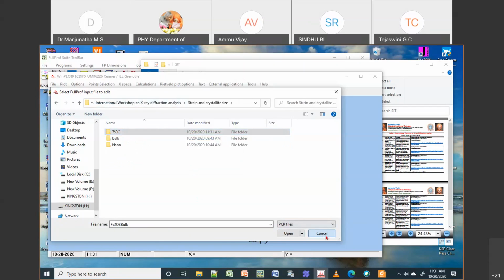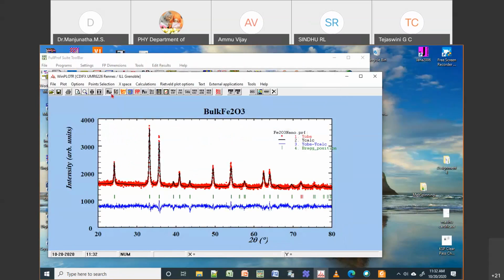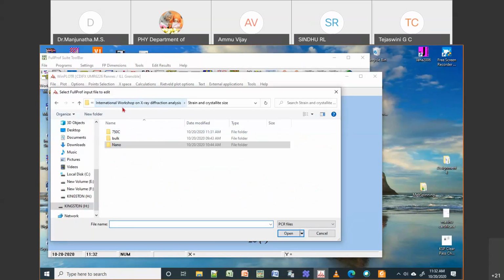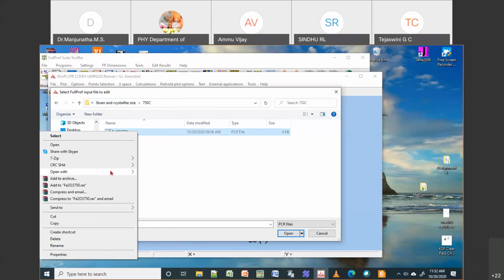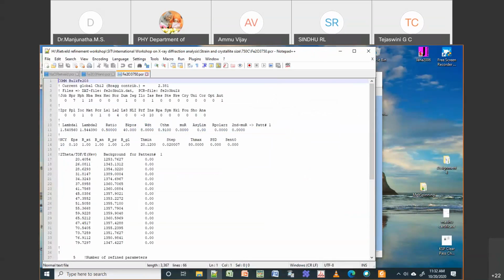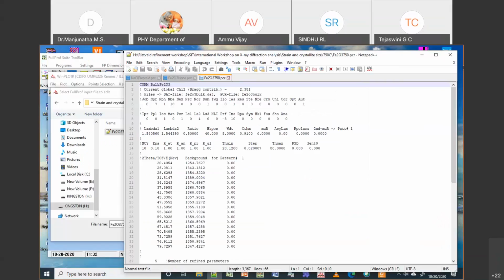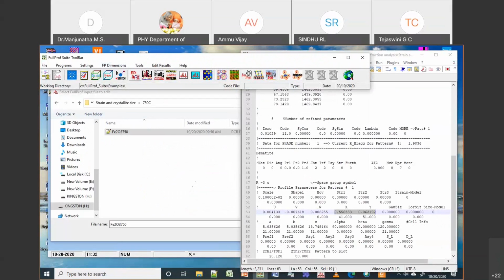So now I can just open that PCR directly, and I can make whatever changes I want to do. So I will open this. We will do it in the same EDPCR. Maybe let me not confuse you with this. So I will open the EDPCR.